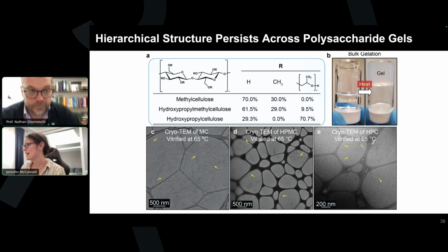Thank you. And then the next question, what do you think regarding environmental scanning electron microscopes for soft material imaging, especially with no sample preparation needed before imaging? Yeah, and look, we've done none of that. But there's no reason. The main reason is you just can't get around to everything. But I think the least impact you can have on that sample, the better, right?